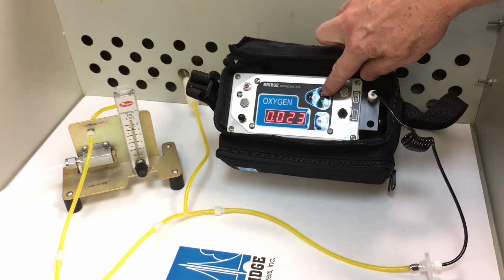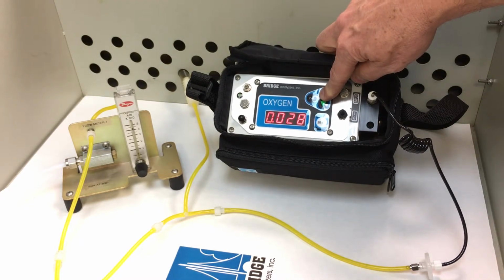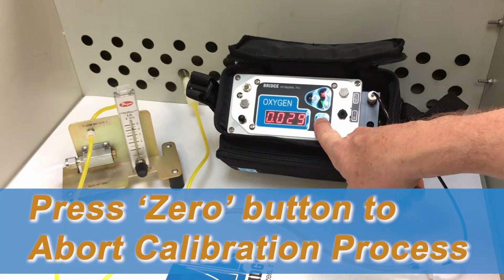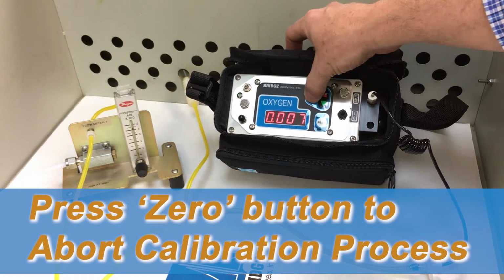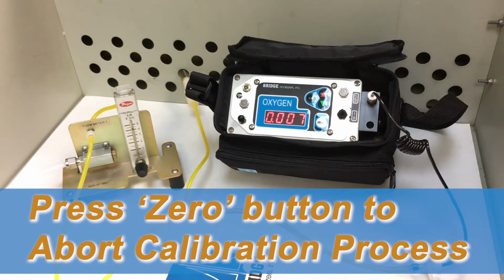If I go ahead and make some changes, all kinds of changes, and I really mess it up, and I say, oh boy, I don't know what to do, you can abort any changes you made by just pressing the 0 button. So if I press 0, now I'm out of the cal mode. You'll see if I press cal, it doesn't do anything. So I aborted the calibration process by just pressing 0.